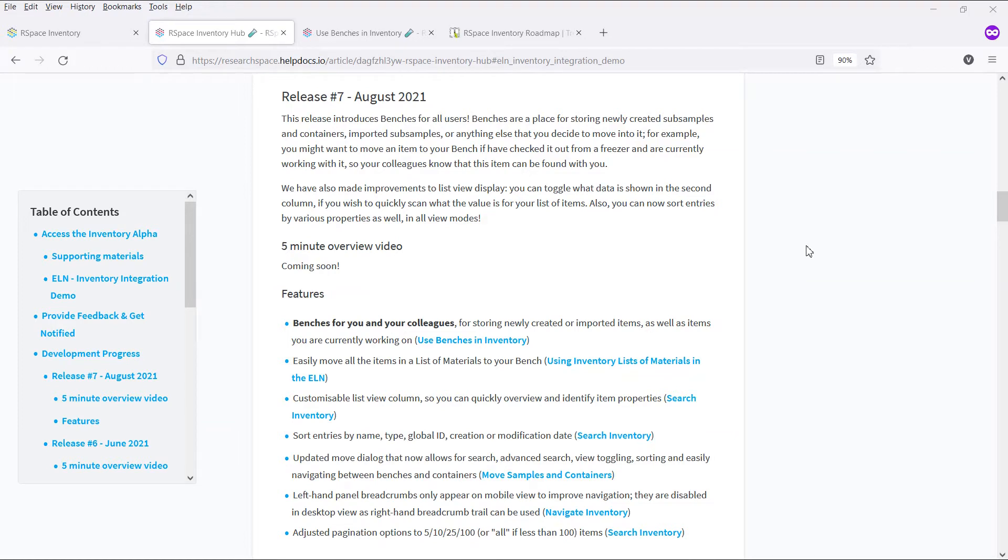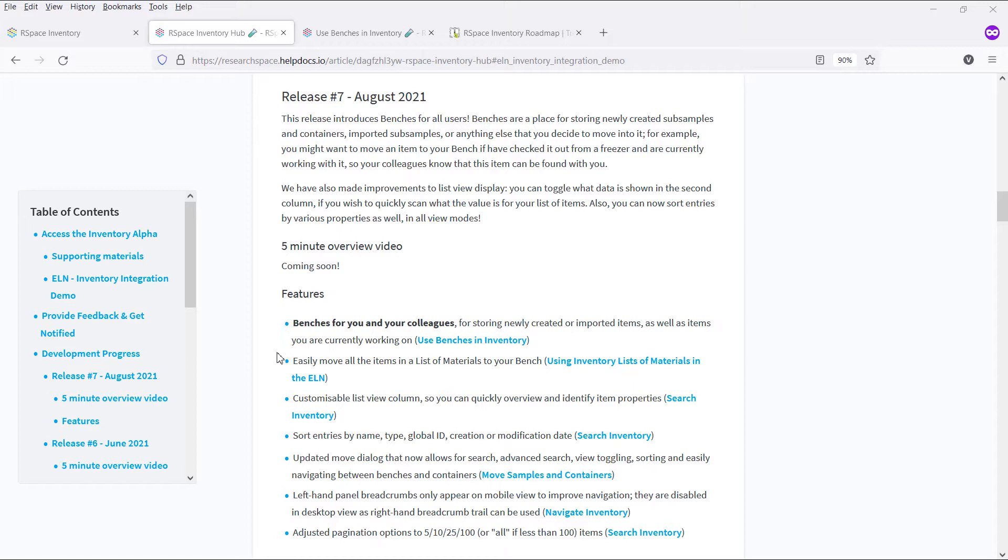Hi, in this video we'll be going over the progress made in the seventh release of Inventory Alpha. The major new feature in this release is the addition of personal benches for you and your colleagues, making it much easier to find items and work with them inside of Inventory.